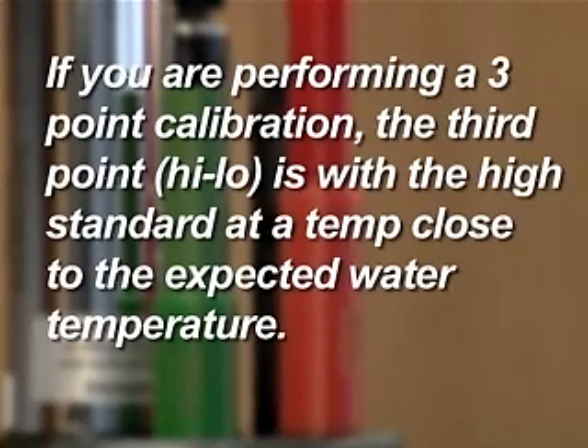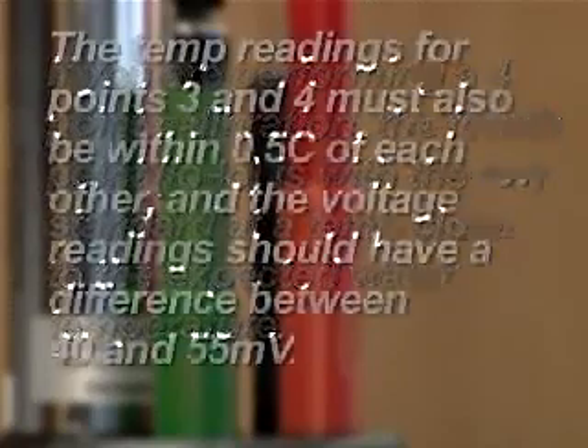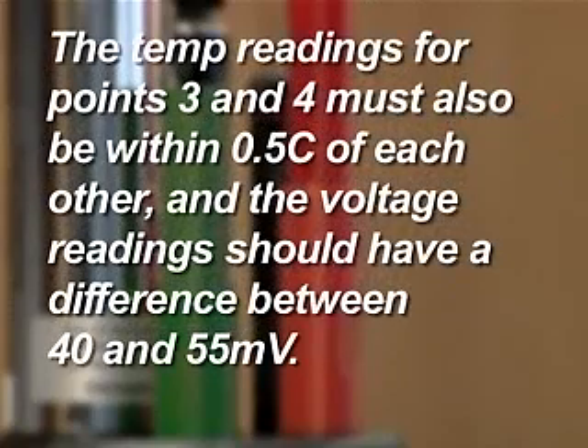If you are performing a three-point calibration, the third point is with the high standard at a temperature close to the expected water temperature. The temperature readings for points three and four must also be within 0.5 degrees centigrade of each other, and the voltage readings should have a difference between 40 and 55 millivolts. The chloride sensor is now calibrated.